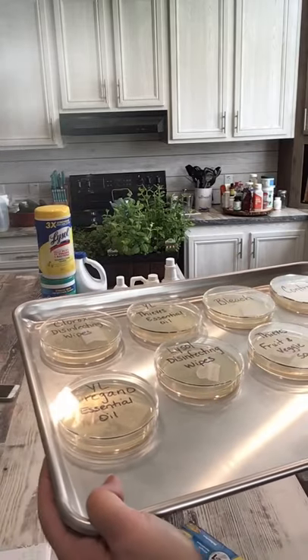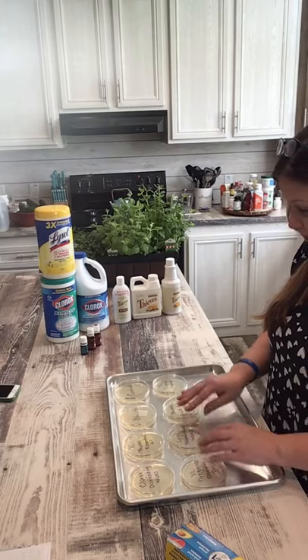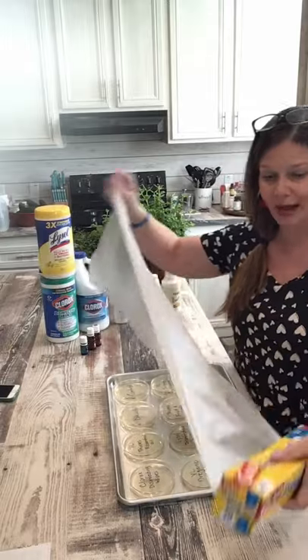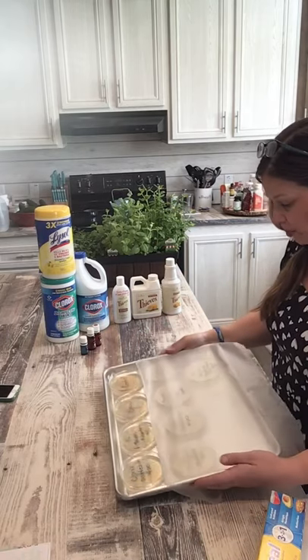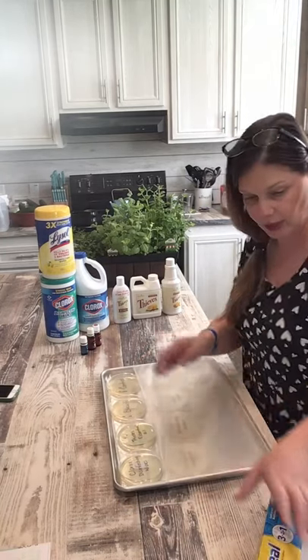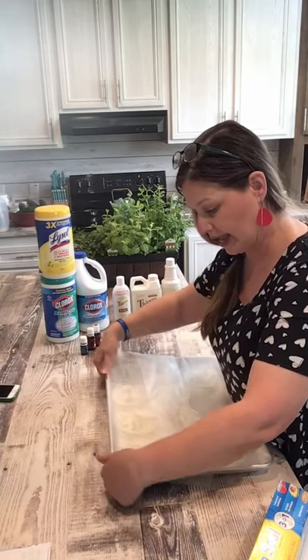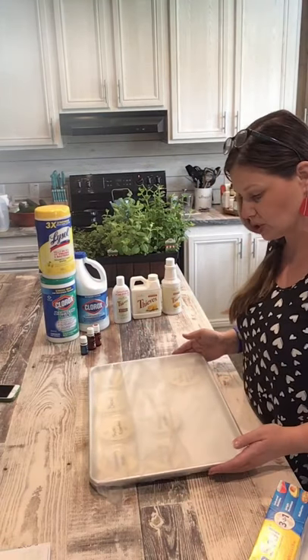I will cover it with saran wrap because they say it grows faster in the heat. My house isn't hot but I will keep this in the kitchen area, since the kitchen is usually the hottest part of people's houses because we're always cooking and using the oven. So now these little precious babies are going to bake — cook, whatever you want to call it. In a couple of days I'll check back and maybe show you the growth every two or three days.